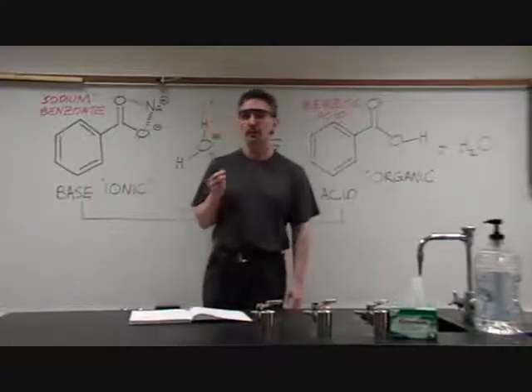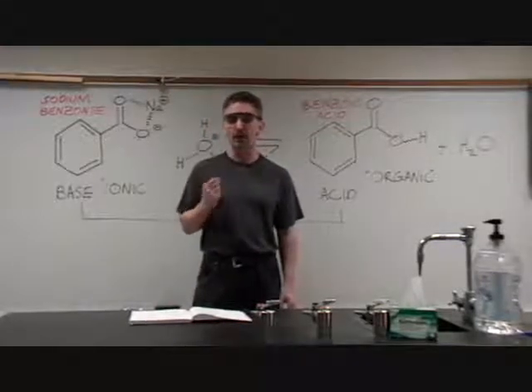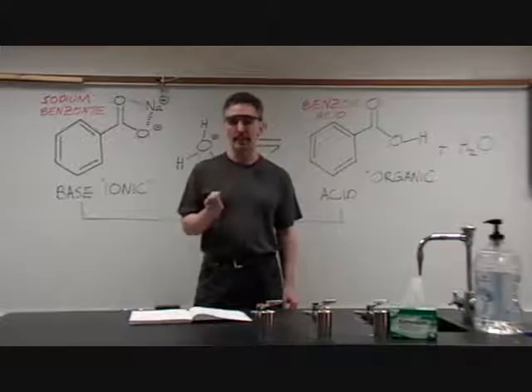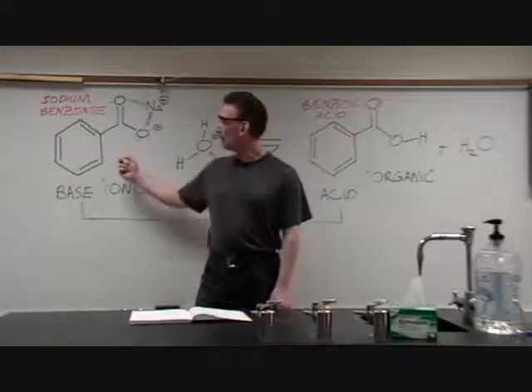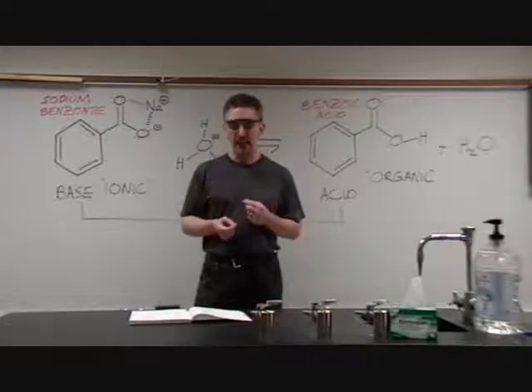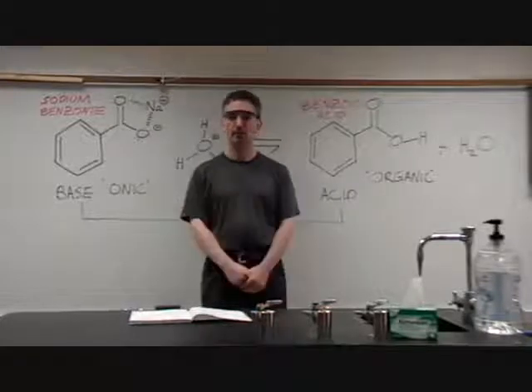Okay, so experiment 1, we're talking about an assignment from a pharmaceutical company who have had a rival company claim that their preservative, sodium benzoate, chemically changes in people's stomachs to a different compound.